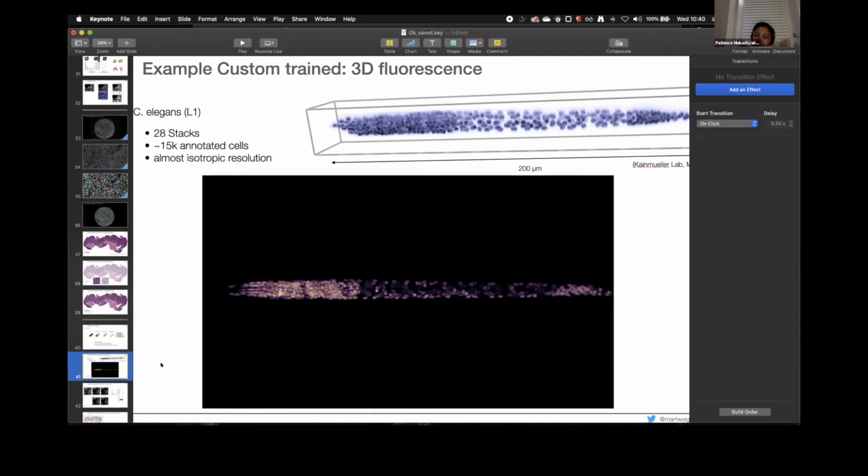That is interesting. We should have a look together, because that is certainly a bug. Okay, yeah, because it goes down when I'm training 3D models. No, but you mean the accuracy? No, you mean the best accuracy you can hope for, in this initial step where we compute, for the number of chosen rays, what your ground truth reconstruction accuracy would look like, right? Yes, yeah.